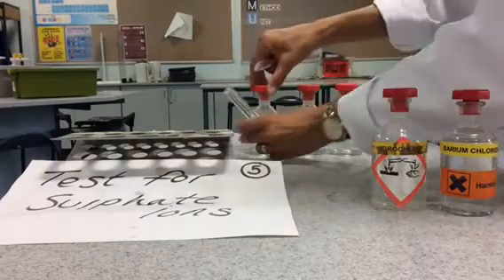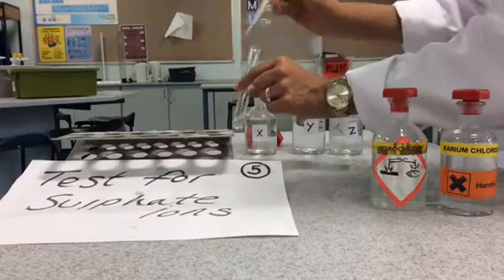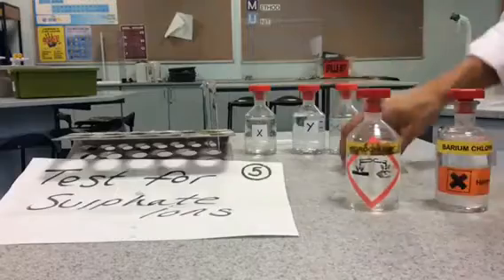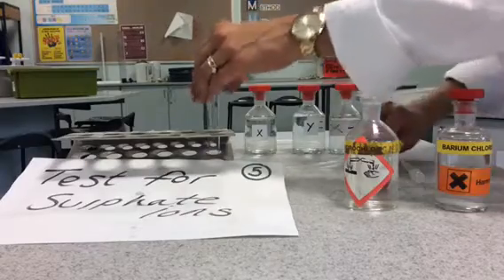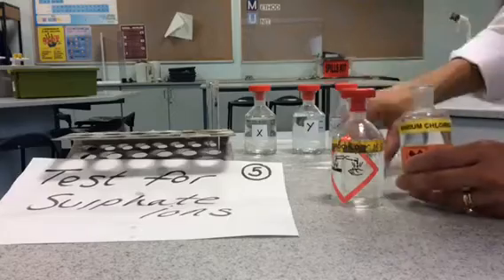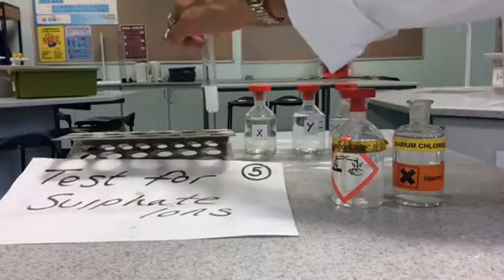Test for sulfate ions. In a clean test tube, add one centimeter cubed of your unknown ionic compound. Then use another pipette to add one centimeter cubed of hydrochloric acid, then add one centimeter cubed of barium chloride. If the reaction produces a white precipitate, then there are sulfate ions present in your unknown ionic compound.